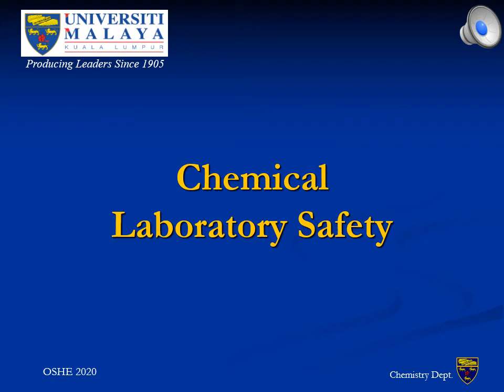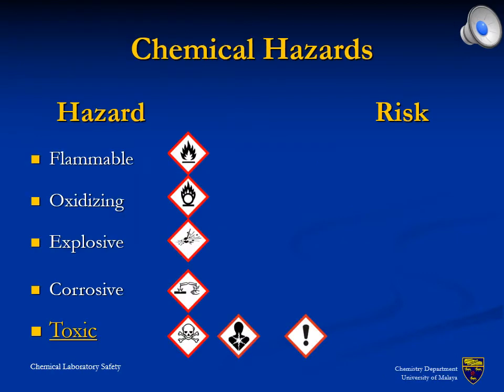A chemical laboratory is a hazardous environment, due to the chemicals inside. Awareness of the hazards associated with chemicals, and knowledge about safety regulations and procedures is, therefore, an important requirement for operation inside a chemical laboratory. There are several hazards related to chemicals.